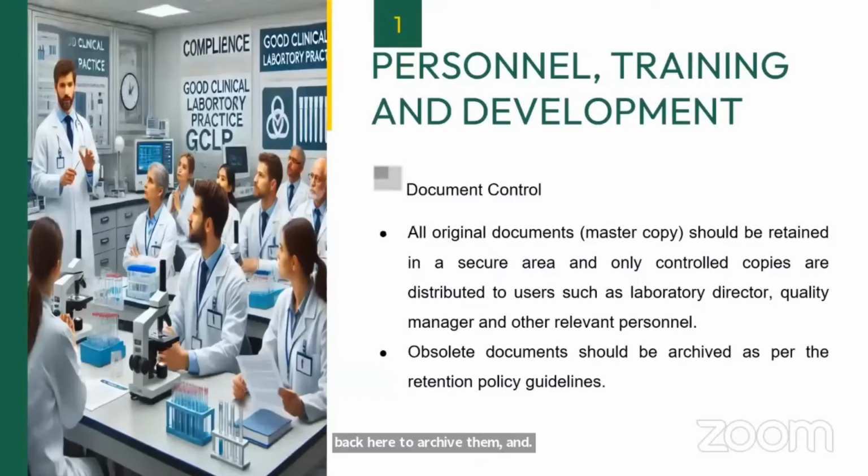Maybe one copy of the previous documents or old versions of the documents you can archive and retain for future reference purposes or as per your laboratory procedure. But it should not be available at the point of use or for the personnel to use, because you have made some changes.